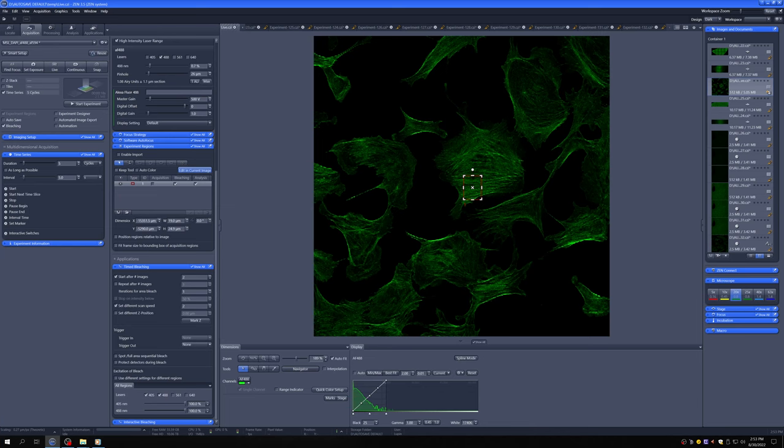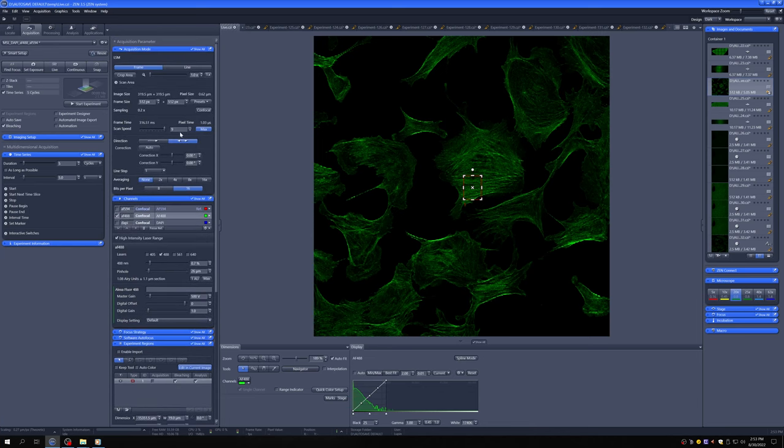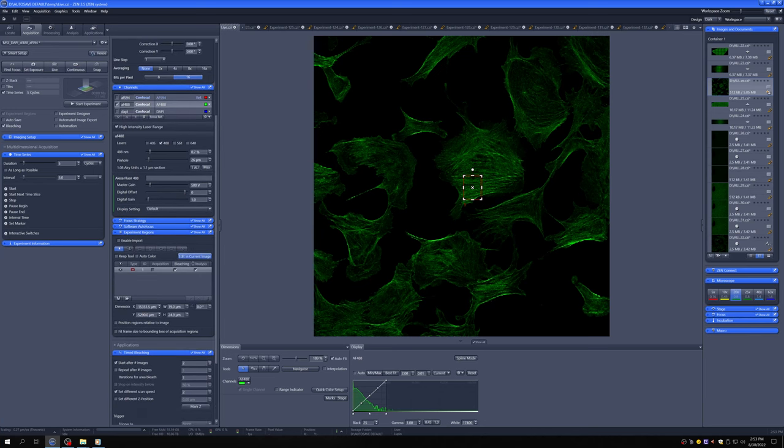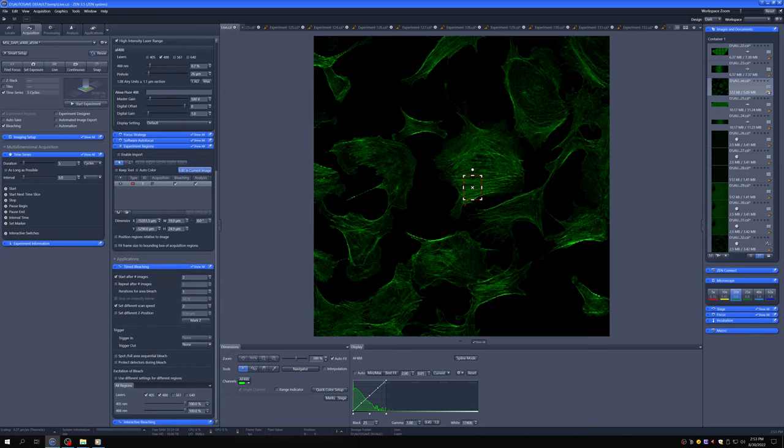Right now we're using a scan speed of 9 to image. You typically want it to go slower so that it delivers more laser power to the sample. And then you have to set which lasers you want to use to bleach and at what power. So I've set the 405 and 488 at a hundred percent.